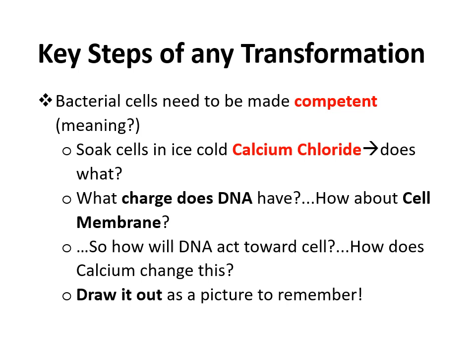So now that you know the purpose of what you're doing in this experiment, and now that you know which plasmid you would be using, now it's important to go through the key steps of any transformation, because when you do a transformation, each protocol might be slightly different in terms of the exact number of seconds that you do something or the exact volumes that you use. But the main steps are always the same.